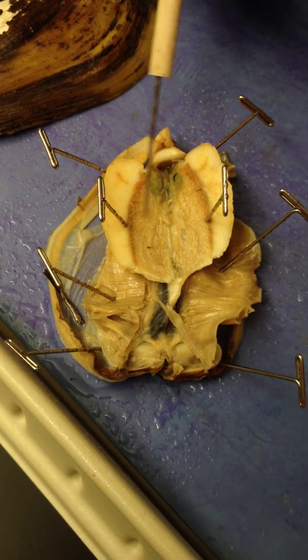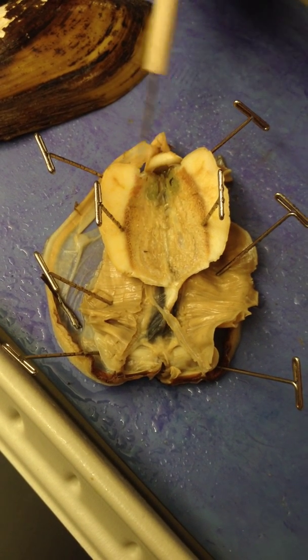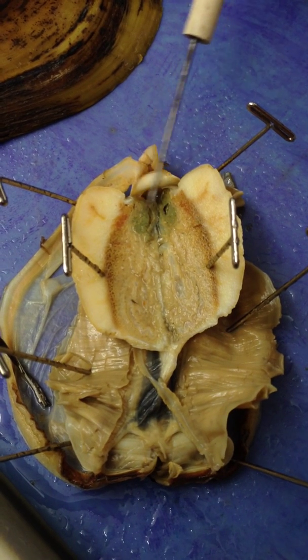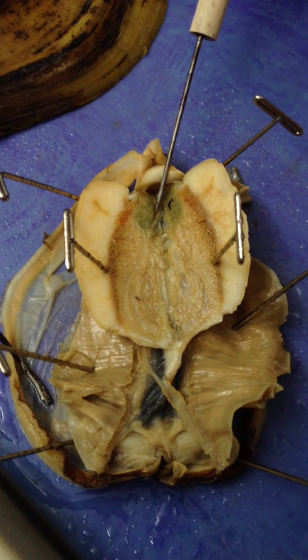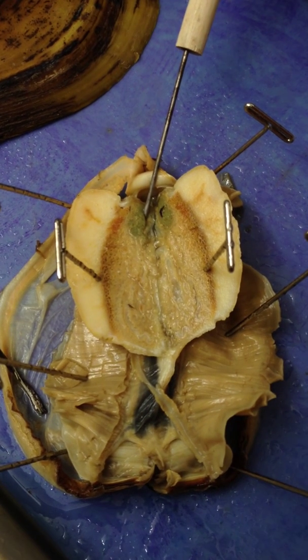This whole brown area, minus the little tubes you can see in it, would be the gonad. And these tubes are the intestine. This green little blob area is the digestive gland. And this whole gap that you can see is the stomach.